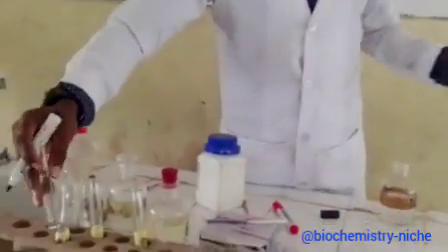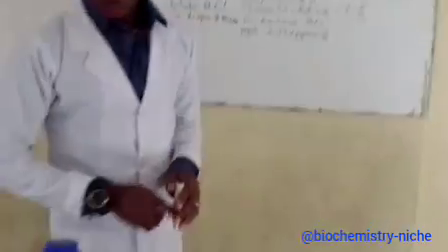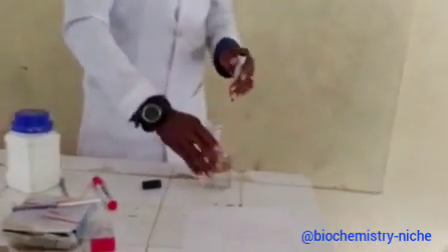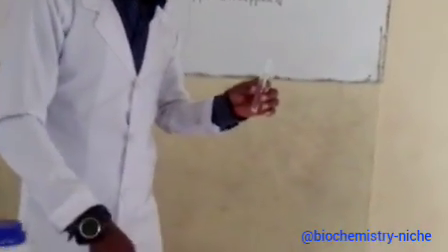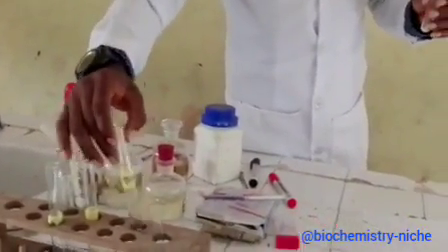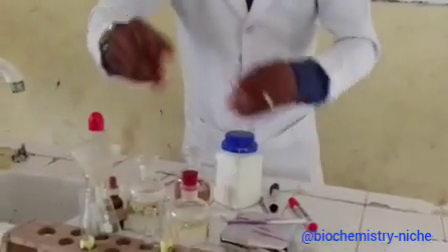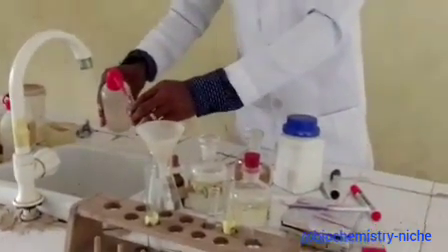So results above, okay? That is what we are suspecting right now. So we said that the CO2 is from the CO3. Now, let's take from this substance here and see what the result will be when we test it on an indicator. We want to add indicator to it. So let me quickly run this.